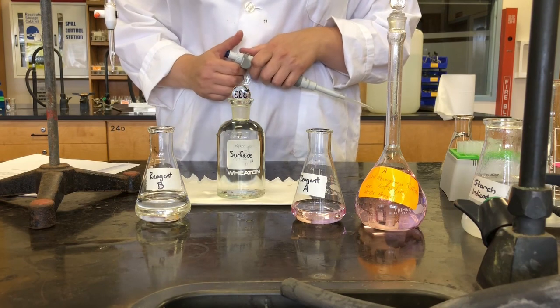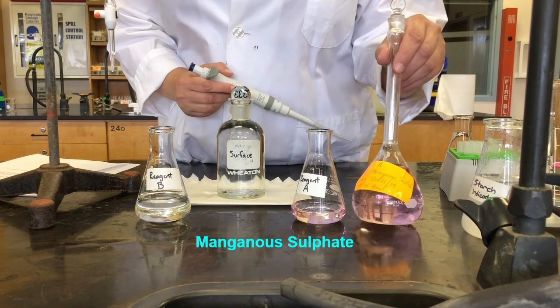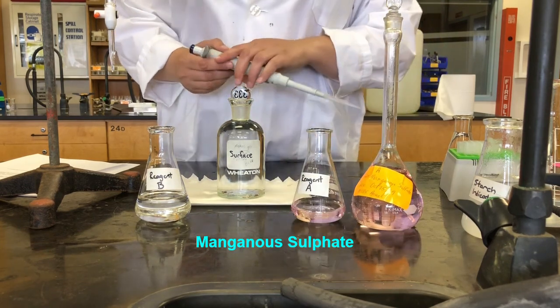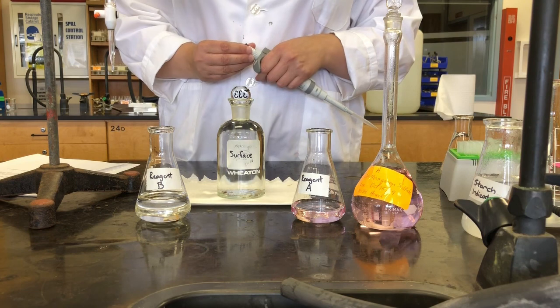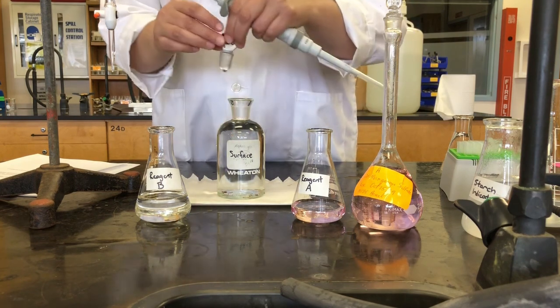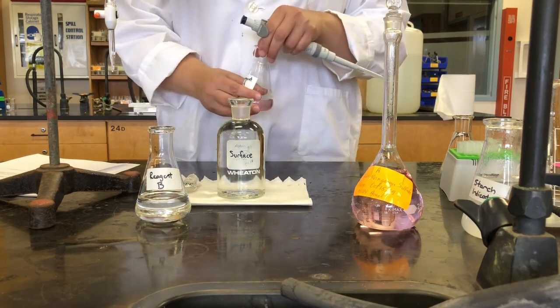So we're going to start by adding manganese sulfate. So this is our manganese sulfate, solution A in your lab manual. We just poured some out in a flask, so it makes it easier for me to transfer. And we use 0.5 mL for every 100 milliliters of sample volume. So we have 300 milliliter bottles, so we're going to use 1.5 milliliters of the reagent.